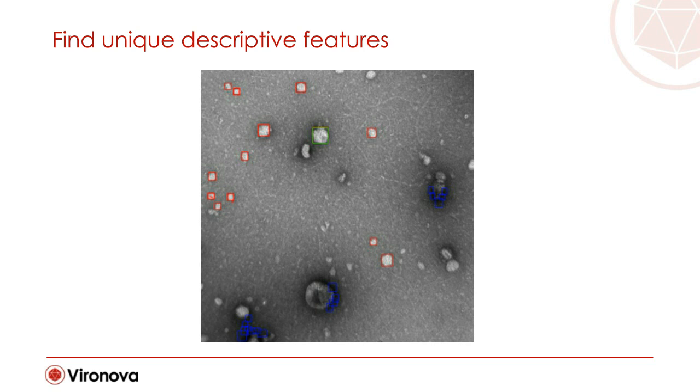In the image on the slide, we have red particles that have the same structural features, the green that varies a bit from the reds, and there is a recurrent structure marked as blue surrounding the VLPs, which contains localizations of protein spikes.